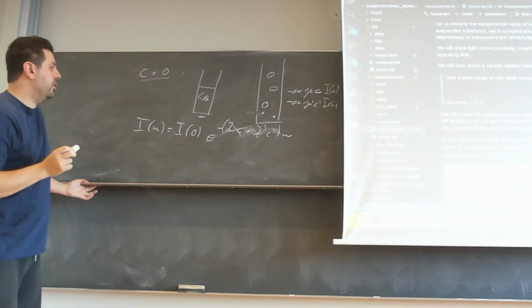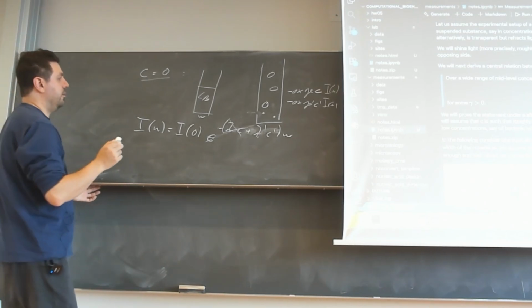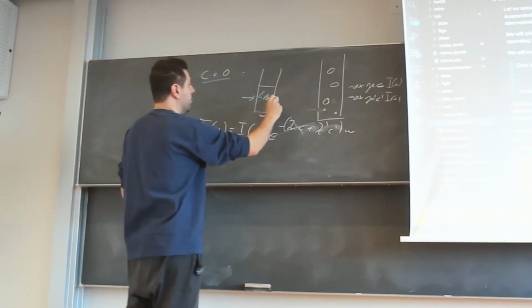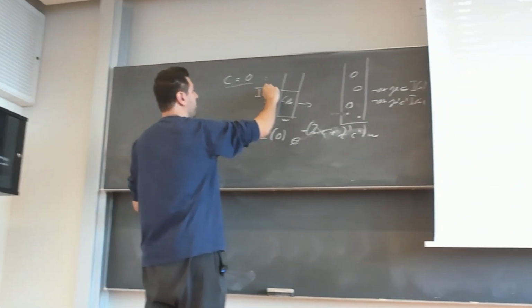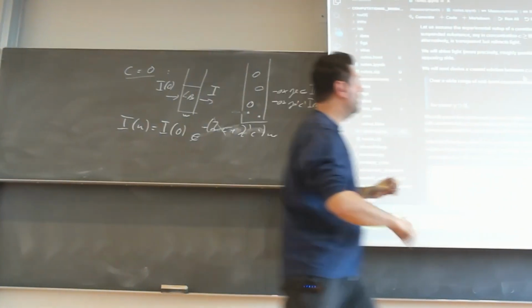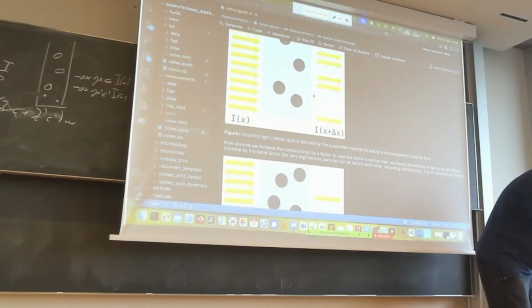And now we can actually look at what happens if we are measuring, because this is what people do. If we are first measuring LB, then we will put some I0 against it, and we will get some I. I called it blank, BLK here. Let's be consistent.